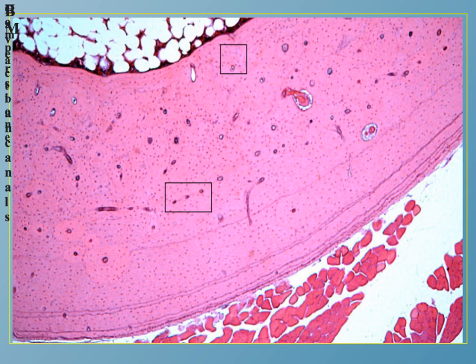This is the picture for decalcified compact bone, which is this layer, and inside the cavity of this decalcified compact bone we have the bone marrow characterized by these multiple fat cells. And this is the ribbon of the decalcified bone covered by a transverse section of the skeletal muscle. Here we have the internal circumferential lamellae, here the external circumferential lamellae, and here the Haversian system.